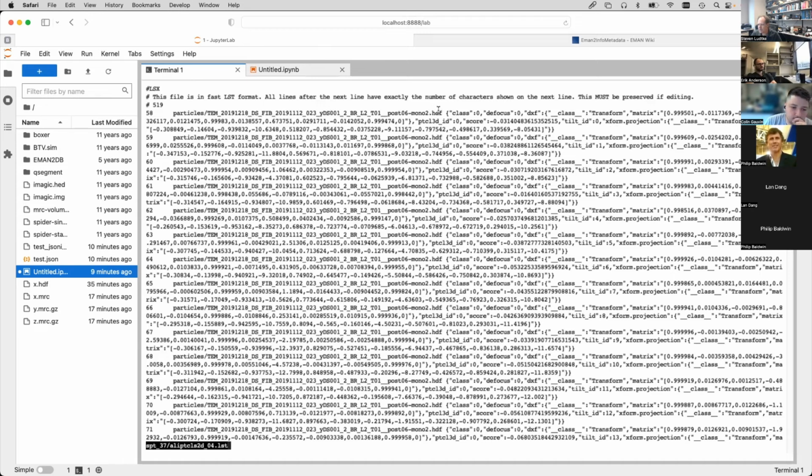So this gives you... they're not stuck at some static length. It's just whatever the longest line is, I'm guessing. So yeah, right. When you generate the file, it goes back and processes it, so it picks the correct line length for the file. There's a normalize operation which will go back and rewrite the file that way.